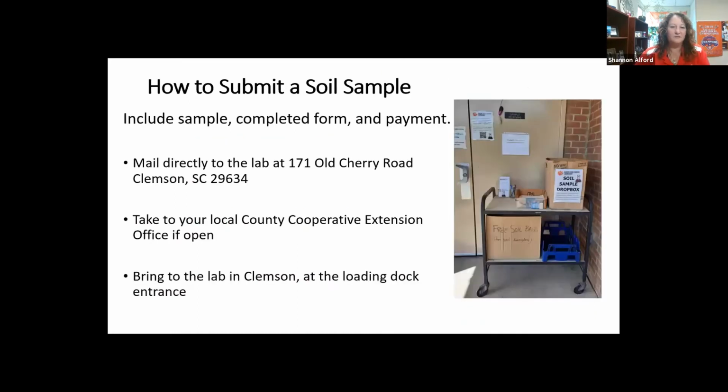All right, so once you've got your sample, you've filled out your form or someone's helped you fill out the form, how do you submit a sample? The picture on the right is our loading dock that I think Michael mentioned in the lab tour. With COVID, we had to really adjust how we did things here at the lab, and we were open the entire time.